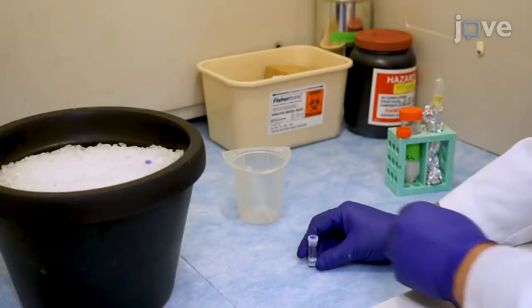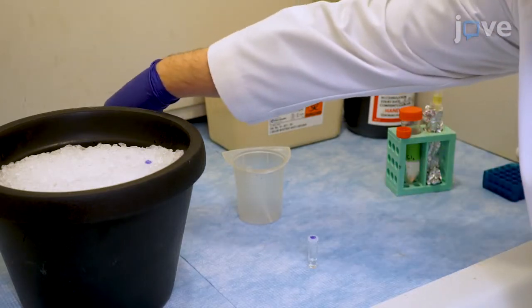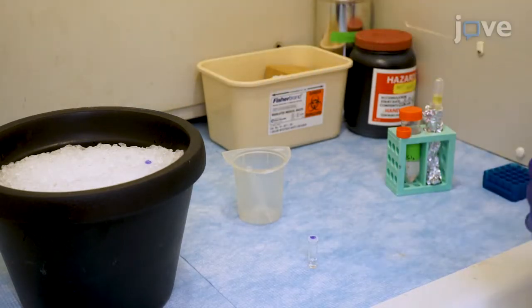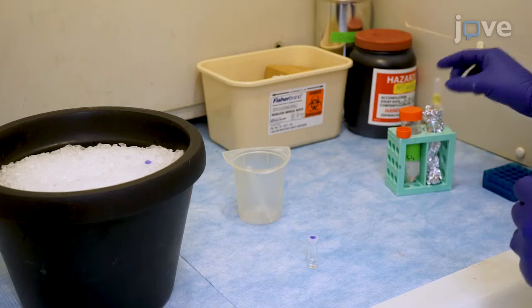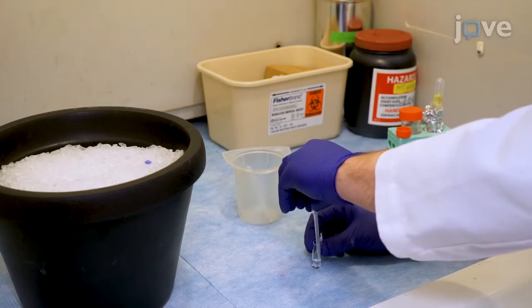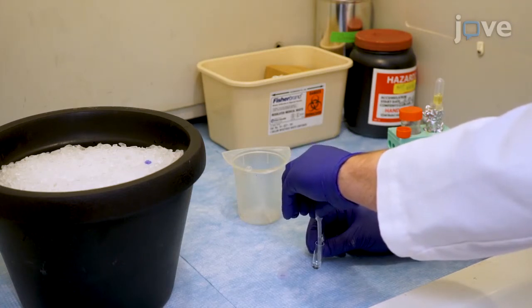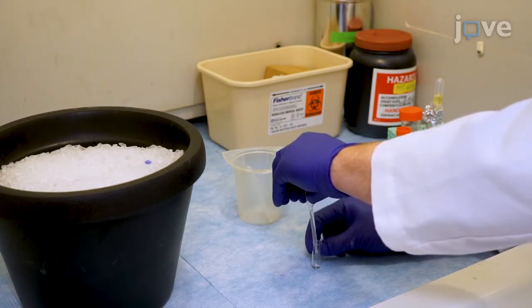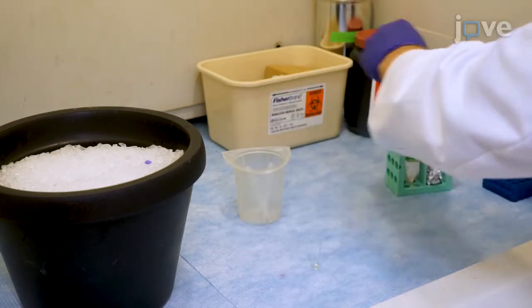After fixing samples in 0.1 molar sodium cacodylate buffer containing 2.5% glutaraldehyde and 2 millimolar calcium chloride, samples should be cut into blocks no larger than 2 millimeters cubed and washed with 0.1 molar sodium cacodylate buffer containing 2 millimolar calcium chloride.